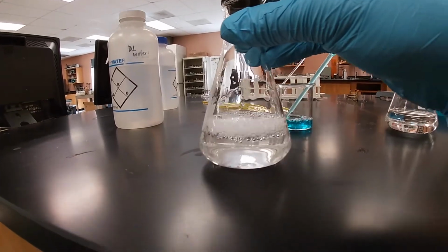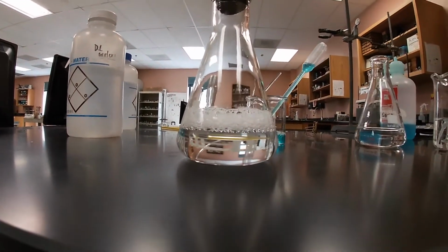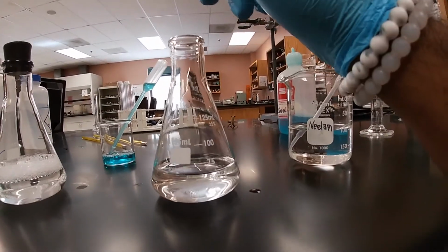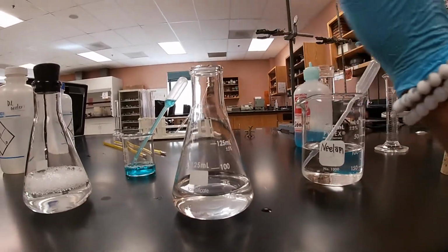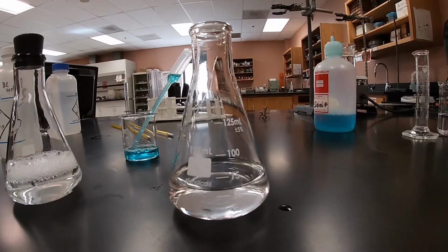Okay. And so this is gonna serve as our standard. And so what we're gonna do is we're gonna do the same thing with our tap water, which we have here. I'm gonna add 1 drop at a time, and we're gonna shake for 10 seconds. And I believe it reads that we shouldn't add more than 20 drops. Okay, so we're gonna test the hardness of the water.